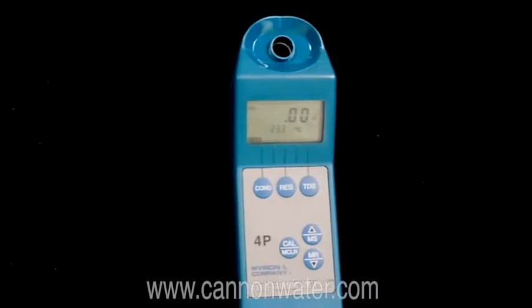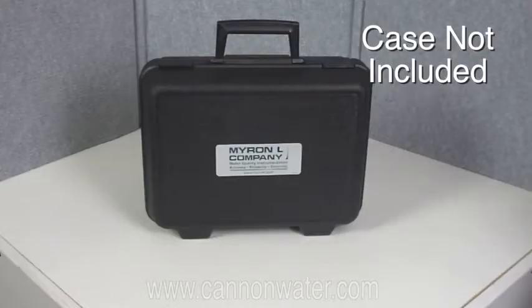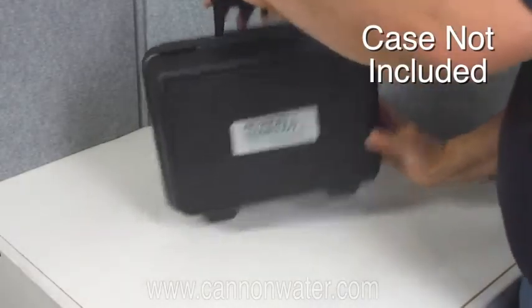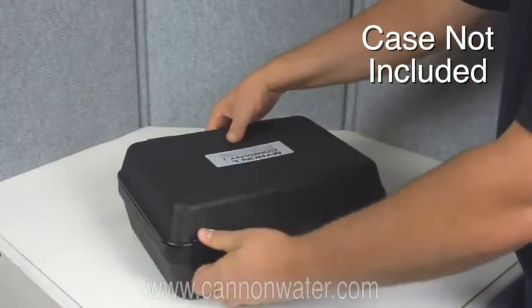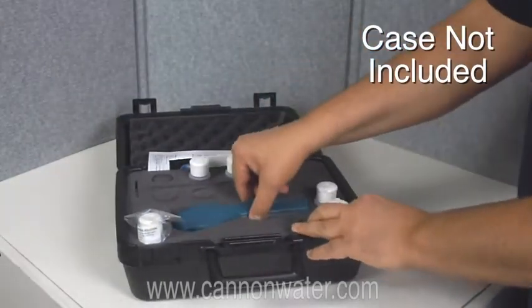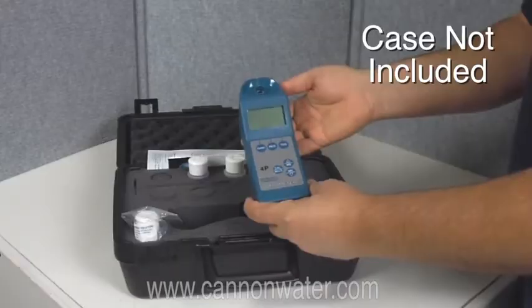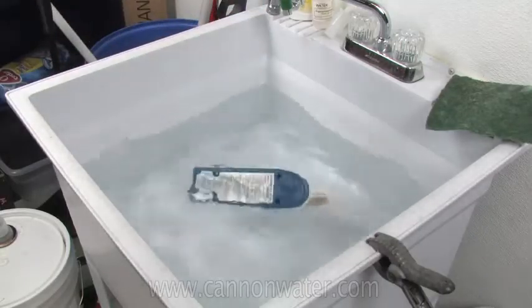Today we're going to talk about the Myronel Ultrameter 4P2. Some of the things I like about the Ultrameter are it is very accurate, it is very easy to use, it is reliable, it is digital and auto-ranging, so all you have to do is pour in a sample and hit a button and you will have a measurement. It is also waterproof — if you drop it in the water it will float.